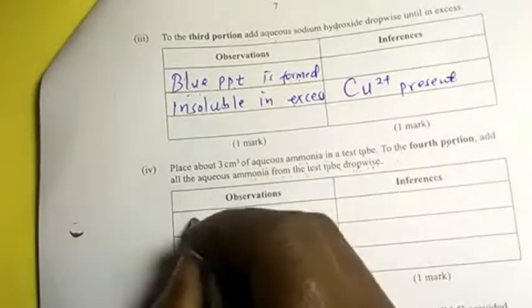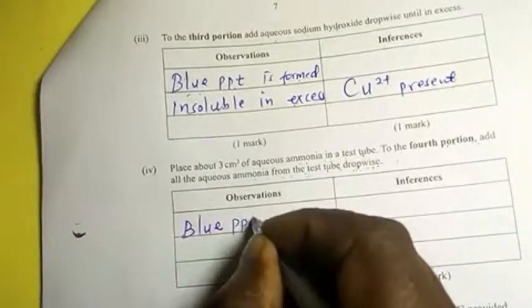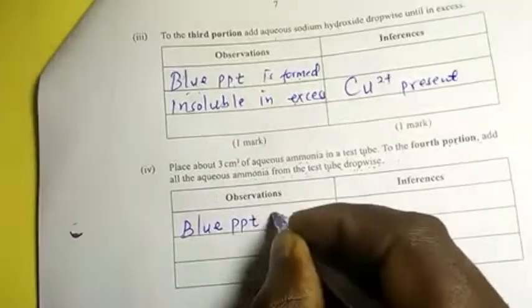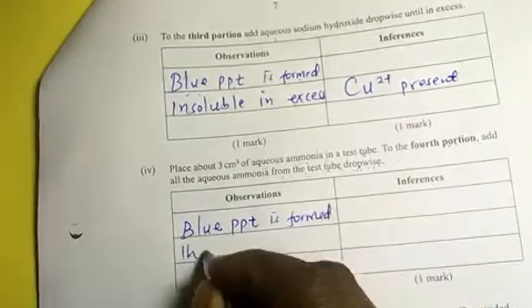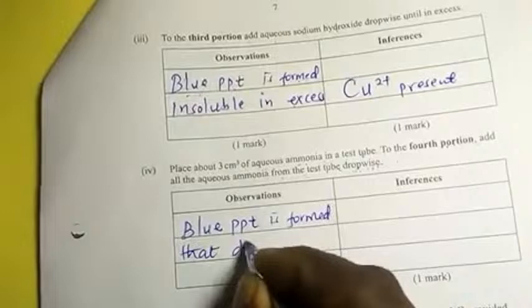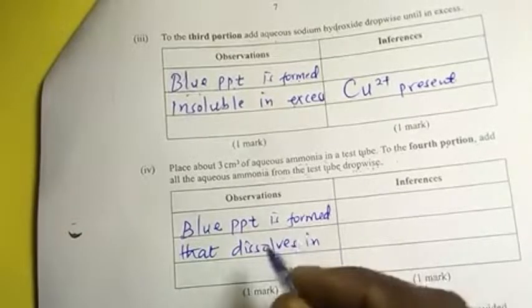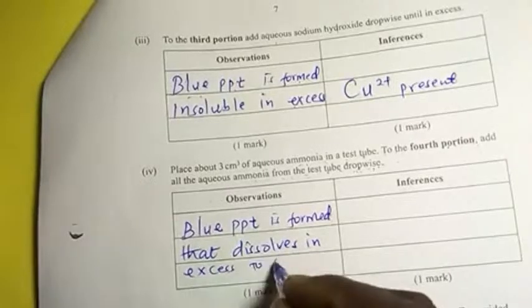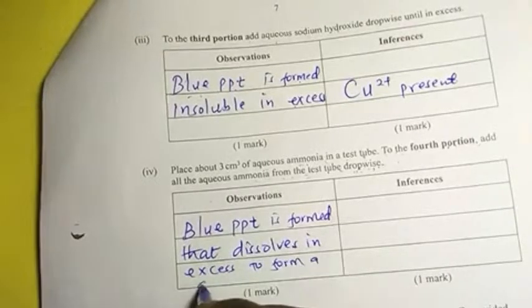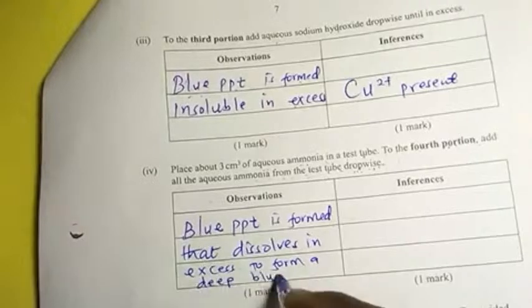So here a blue precipitate is formed. It starts to dissolve in excess to form a deep blue solution.